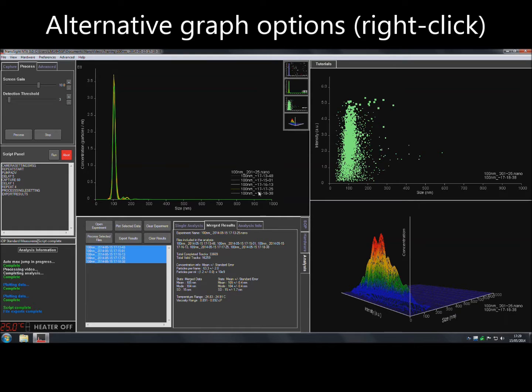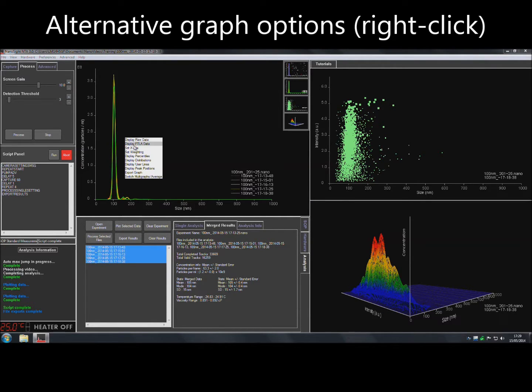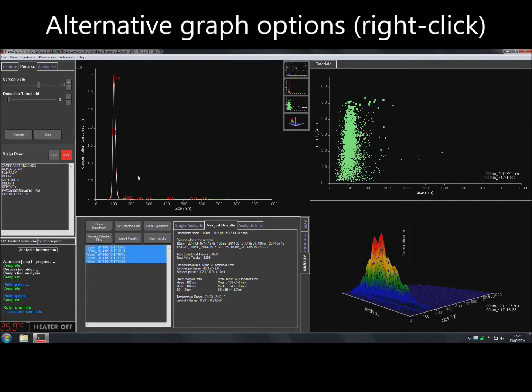For alternative graph options, right click on the center of the graph and select the desired option.